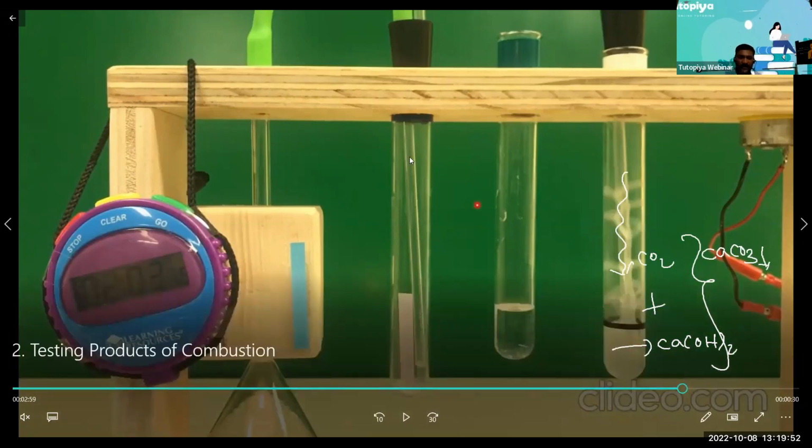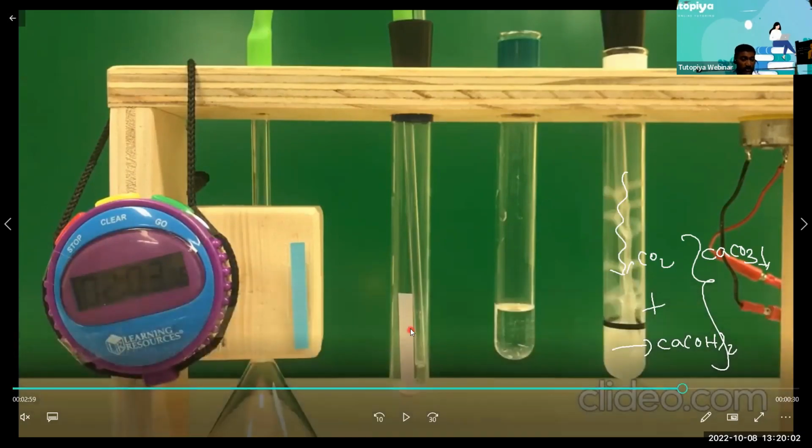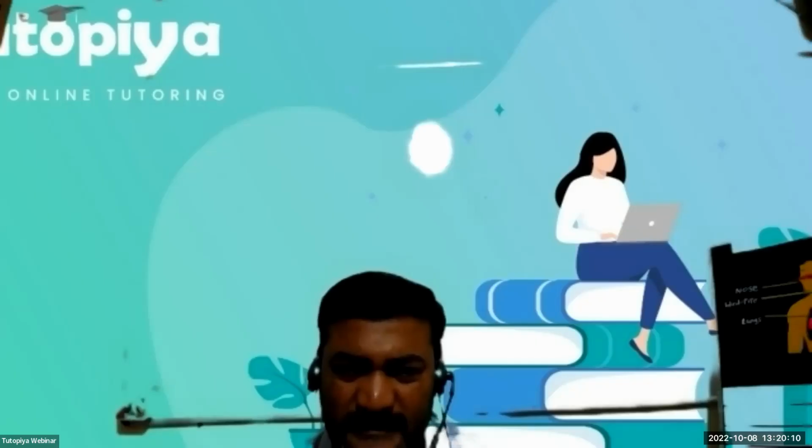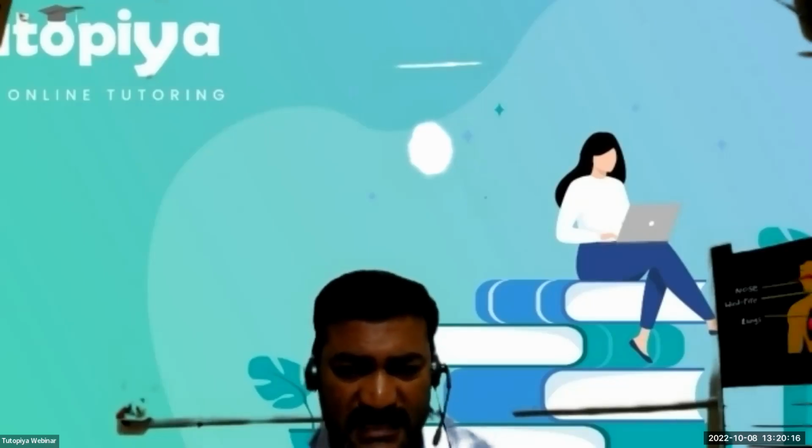That's white color. Okay, and look at here. The blue color paper has already turned pink color. That is a test for water. So you have learned two tests. Test for water by using cobalt chloride paper and test for carbon dioxide by using calcium hydroxide. Is that clear? Am I making sense? Yes. Okay, great. Thank you. Now, let's go with the next activity.